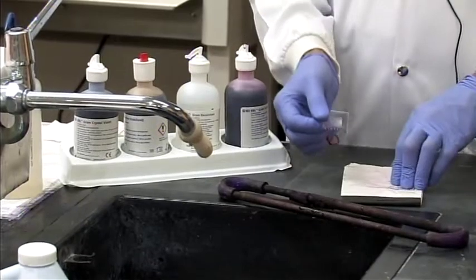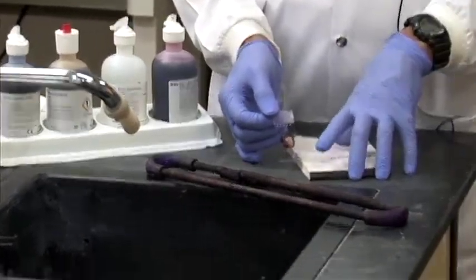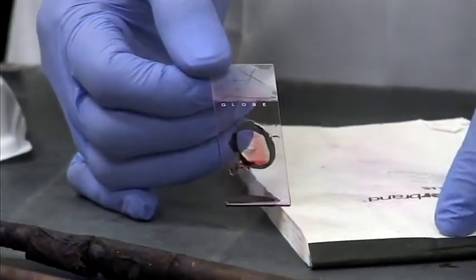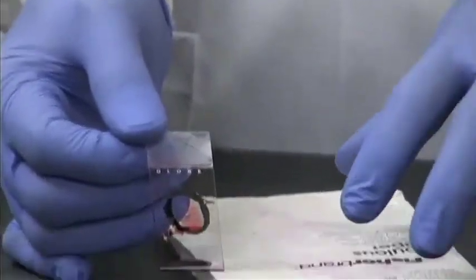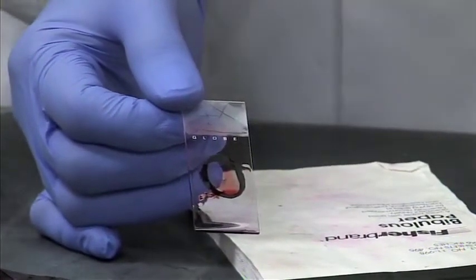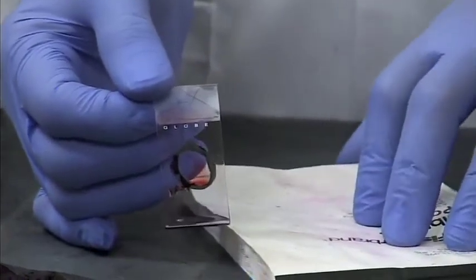At this stage, I want you again to imagine or figure out what is the color of the cells before you go to the microscope. Again, the gram-positive cells would have retained that bluish-purple color because of the thick layer of peptidoglycan, whilst the gram-negative will be pink or red now with this counterstain, because remember before at this stage it was clear in color. When we apply our counterstain, it will impart a color of pink or red in those cells.